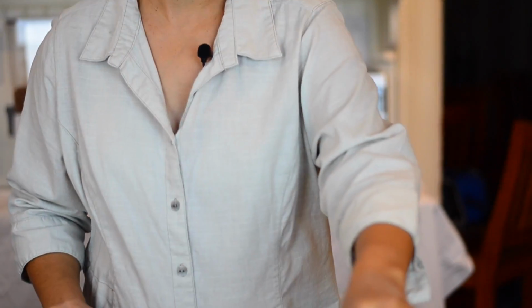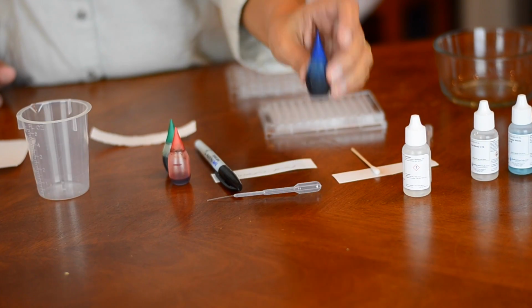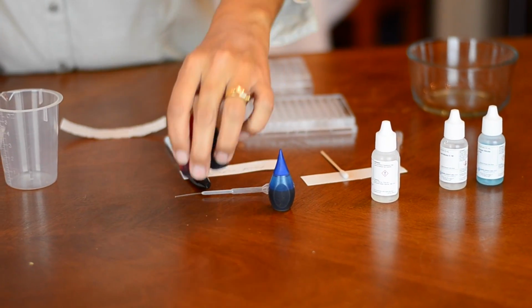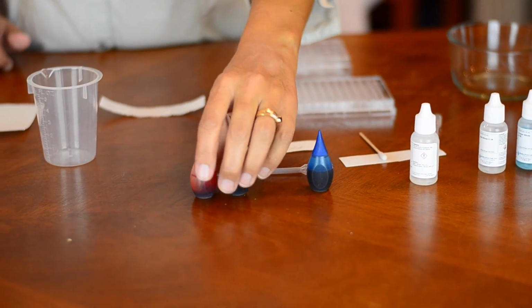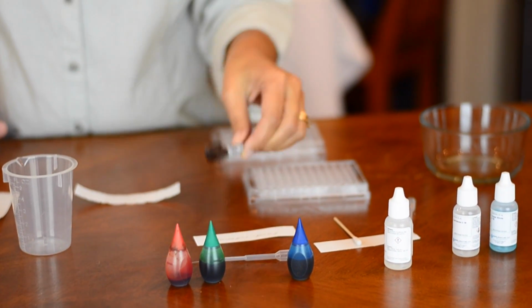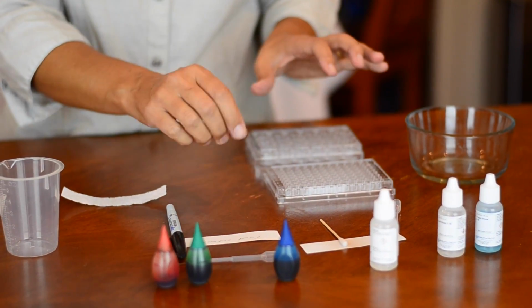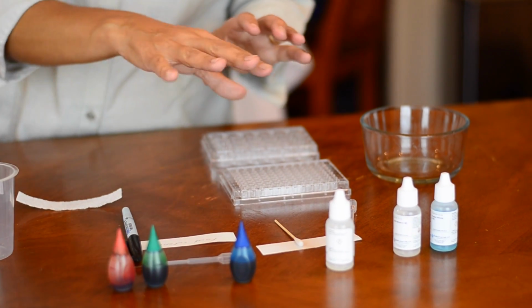The other reagents on our list, you can experiment. This is where you can add things that you think of. I've brought some blue food coloring. I brought other colors, but since we don't have a very big piece of paper, I'm only going to use the blue. And then a felt marker, which we can use as well. Over here, I've added a cotton swab that we're going to use.